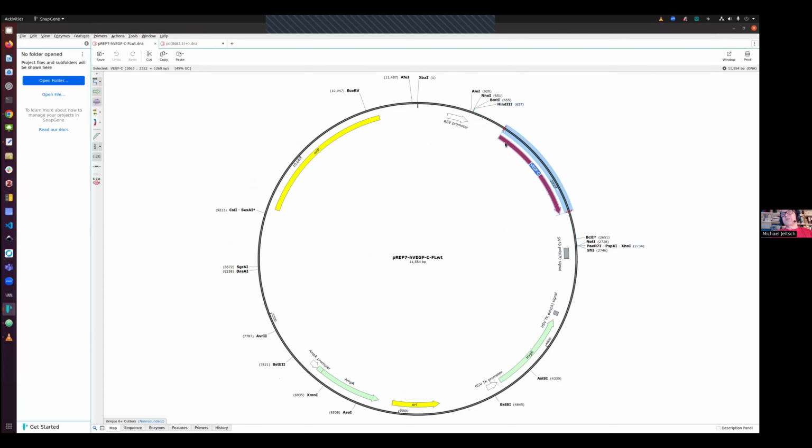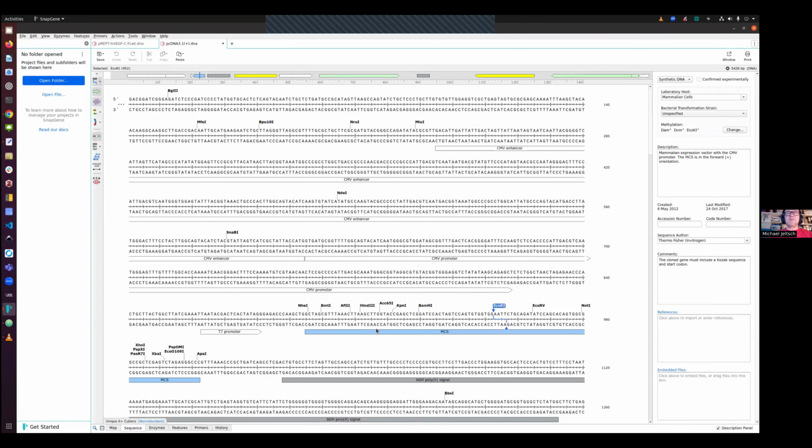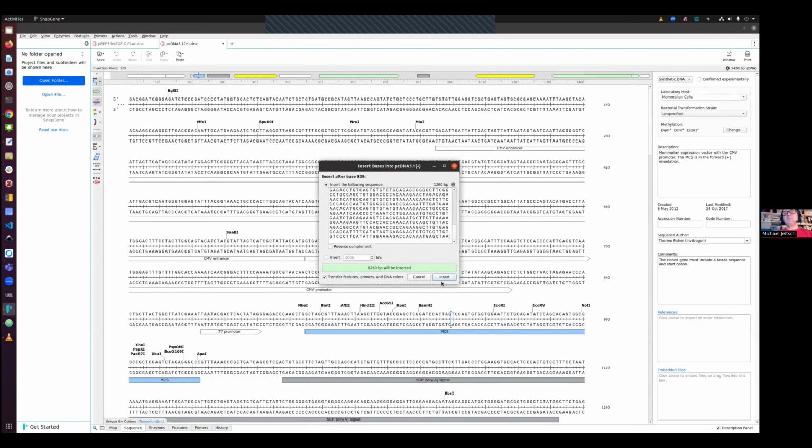This is the only thing that counts for us. So you can just select it, then hit Control C, and then go here, look somewhere at the sequence, somewhere in the multiple cloning site, and then hit Control V or just say paste. Yeah, you can simply do that.